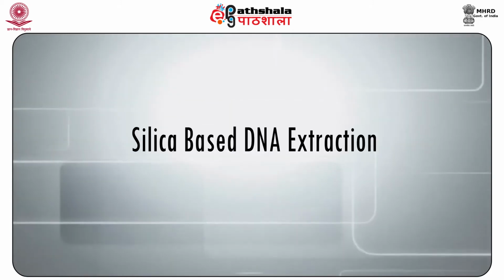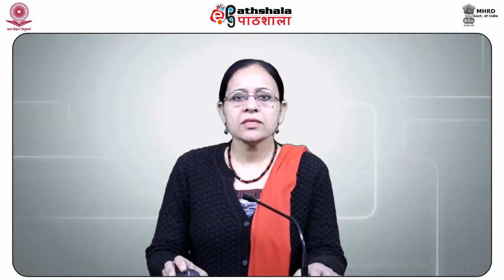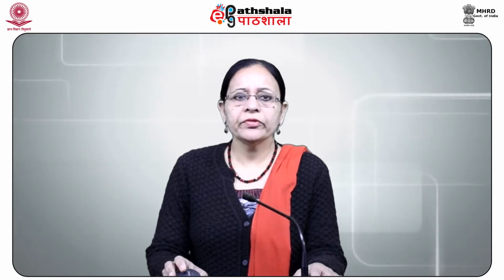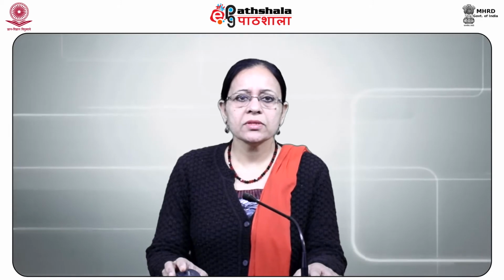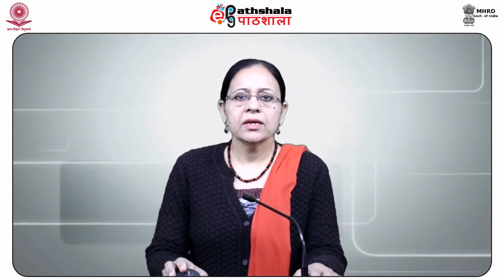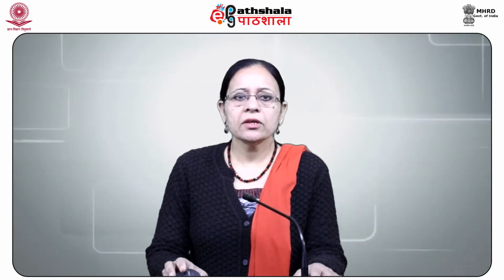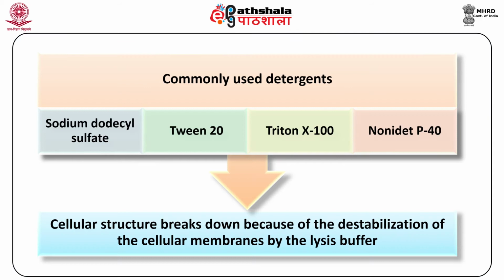Silica based DNA extraction. Usually the salting out process has been widely employed in the field of molecular biology. The very first step in the extraction process comprises incubating the cellular material in a lysis buffer, which includes a detergent and proteinase K. The commonly used detergents are sodium dodecyl sulfate, Tween 20, Triton X-100 and Nonidet P-40.